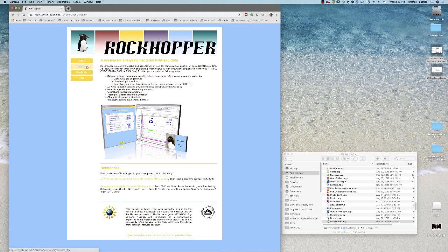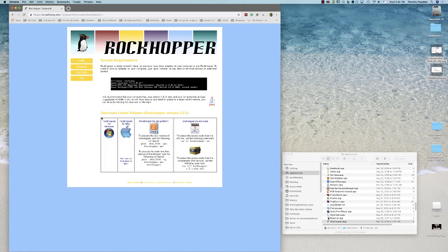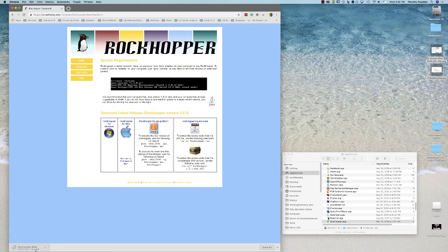You'll then click on download, and then you can pick the interface that you use — either Mac, Windows, or if it's Unix, you can download the jar file and use that. I'm going to pick Mac because that's what I've got here. So you click on Mac and it downloads the file. The RockHopper is now downloaded.